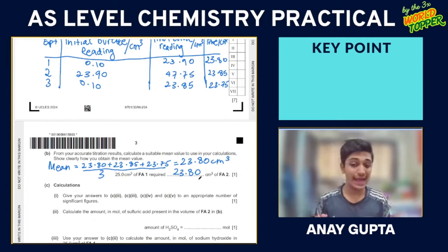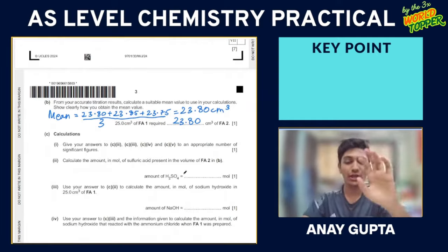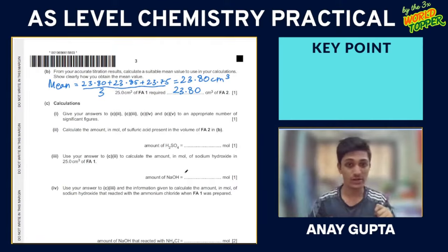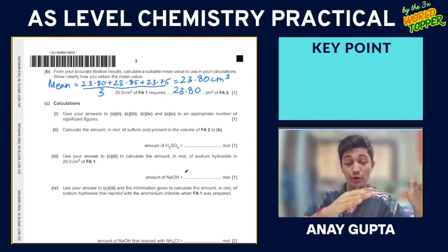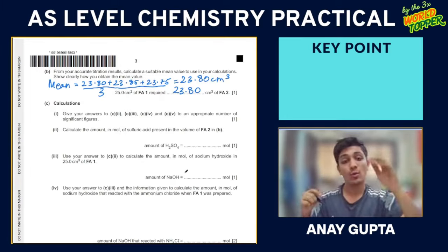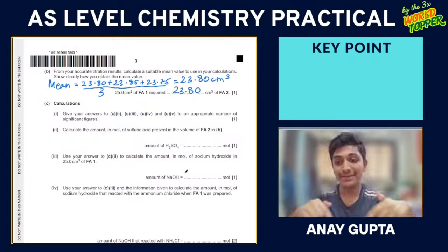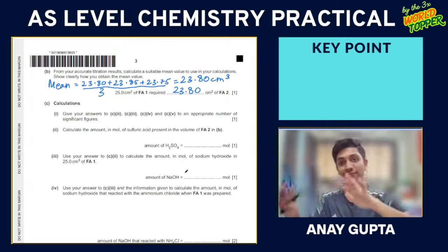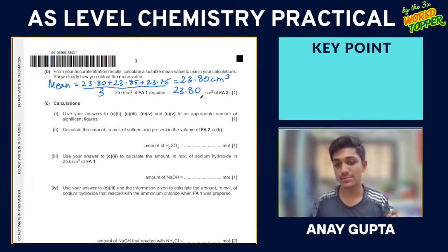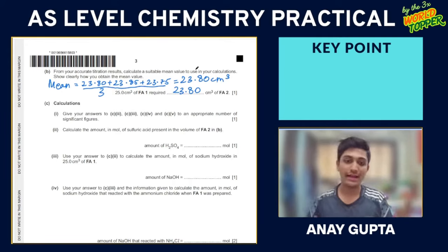Now again, two decimal places. You need to record your accurate number of significant figures. Now, this was recording, like I just told you in the physics practical video. If you haven't watched it, go watch that here. But when you're recording a value, you need to record to the instrument's least count. But now when I'm calculating values, I will need to calculate to about 3 or 4 significant figures, since my value recorded over here is correct to 3 or 4 significant figures.